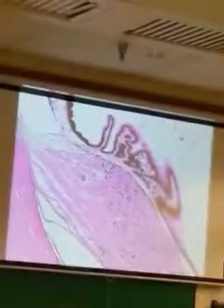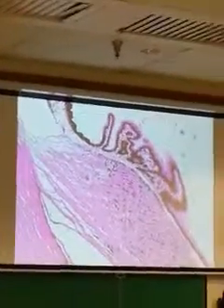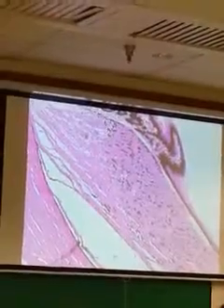So is this, I know I keep saying it, but is this on the list? Do we need ciliary processes? Yes. No, you don't need the process, but you do need a good marker for the ciliary body.